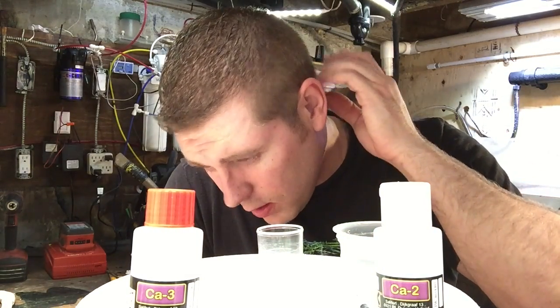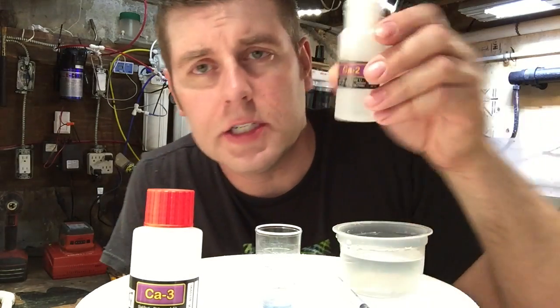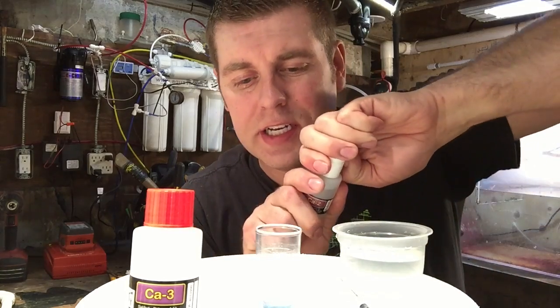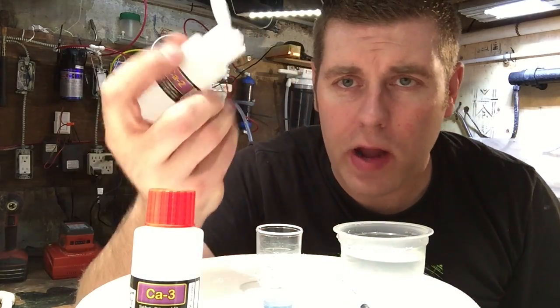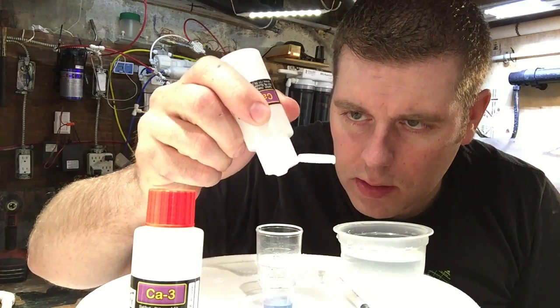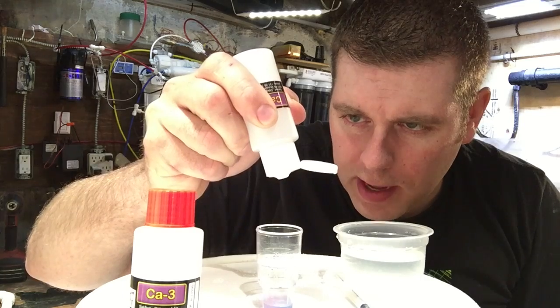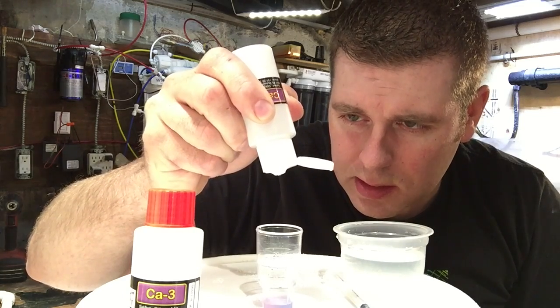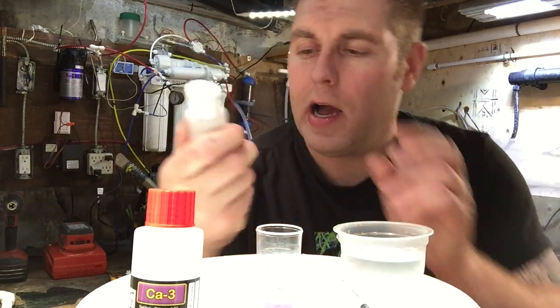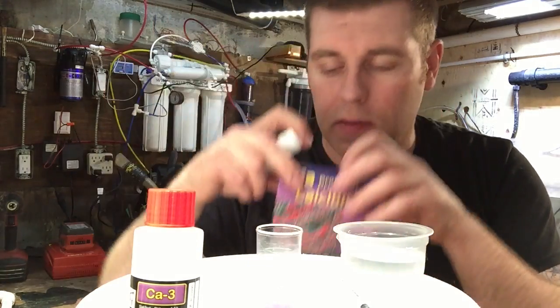We don't mix this yet — we're gonna wait. So we're gonna grab our CA-2 and put eight drops of this in here. Don't mix that yet. Count out eight drops: one, two, three, four, five, six, seven, eight. There's eight drops of the CA-2 in the water solution. Put that back in the box.